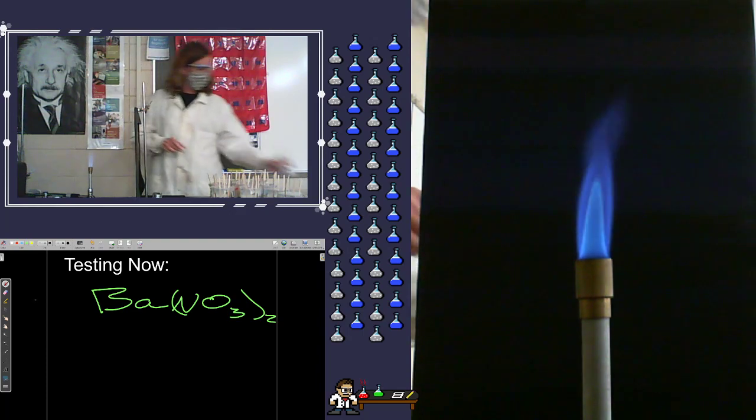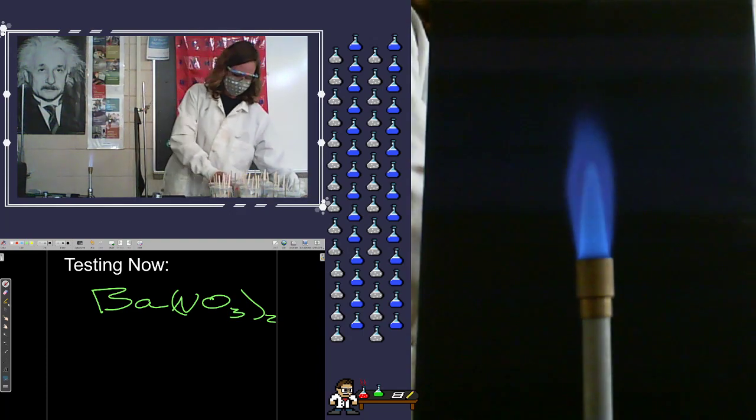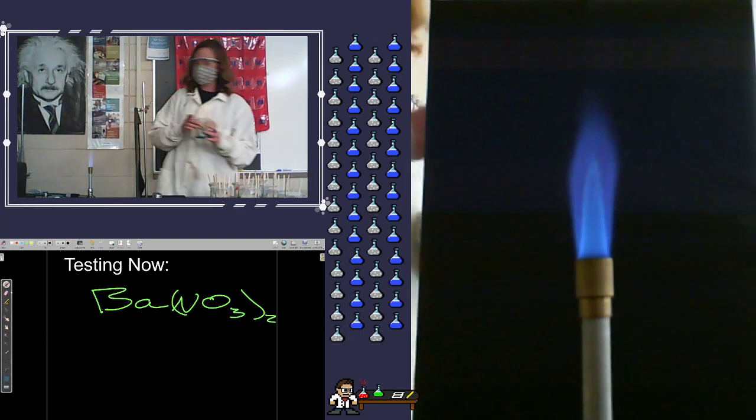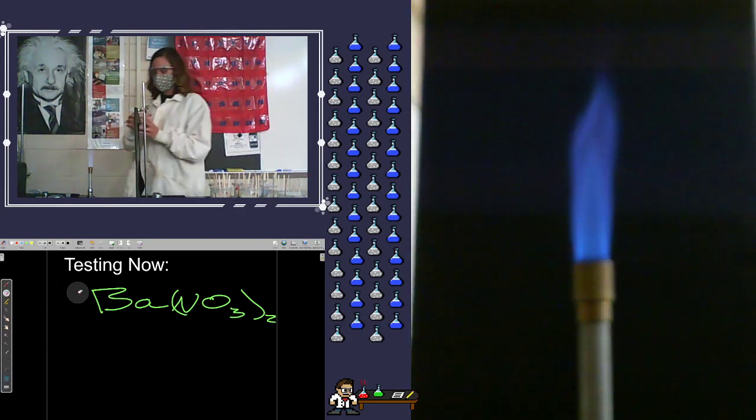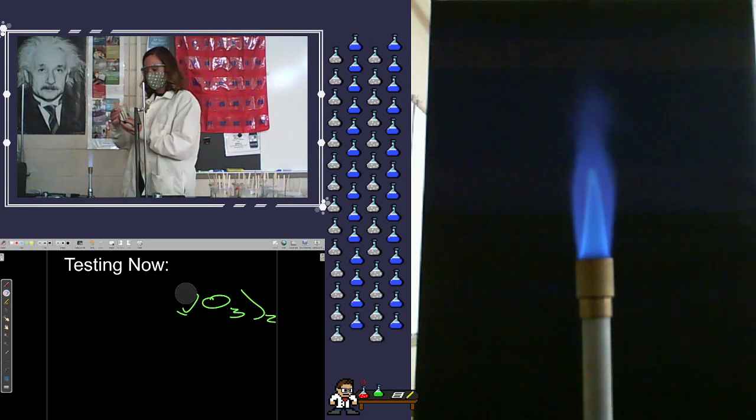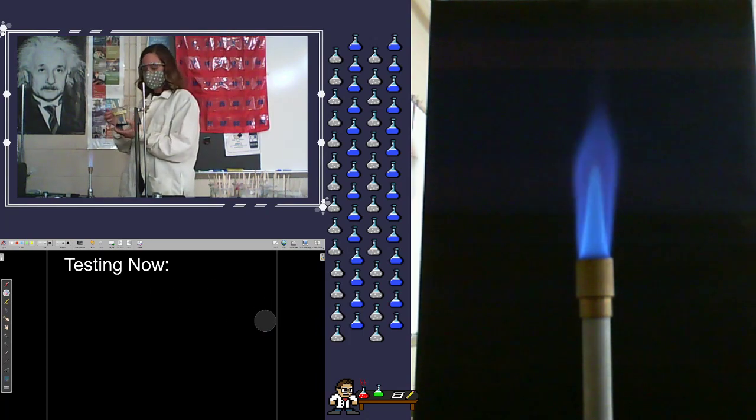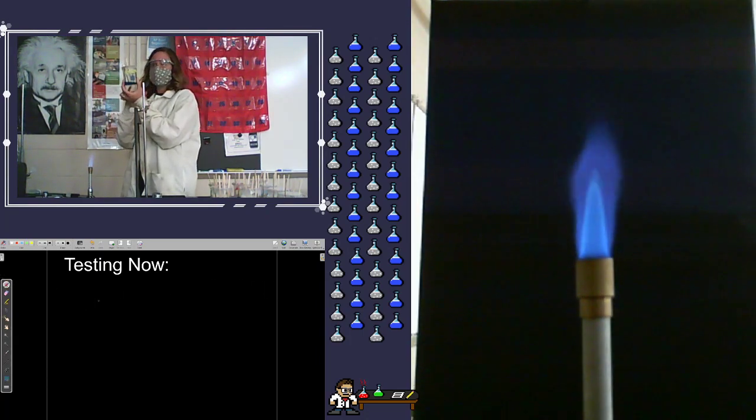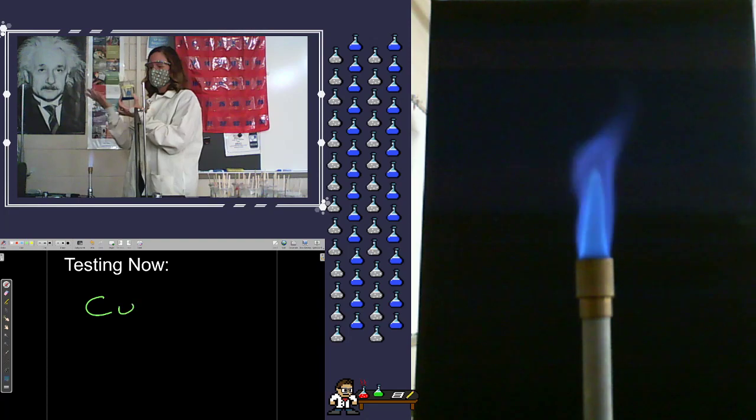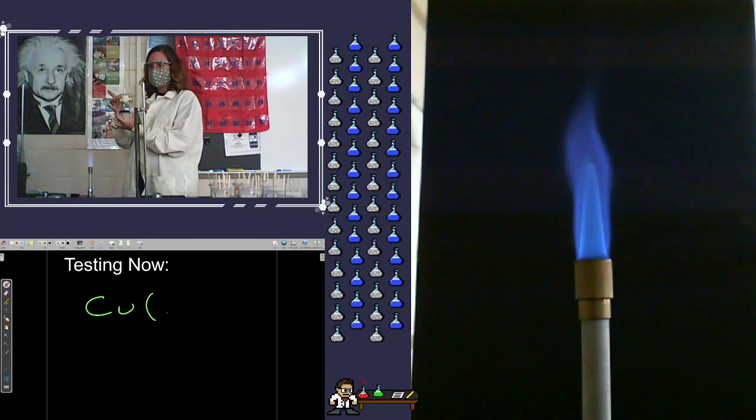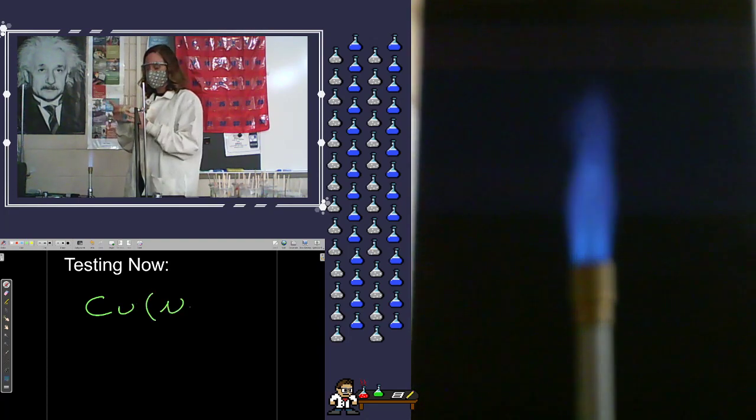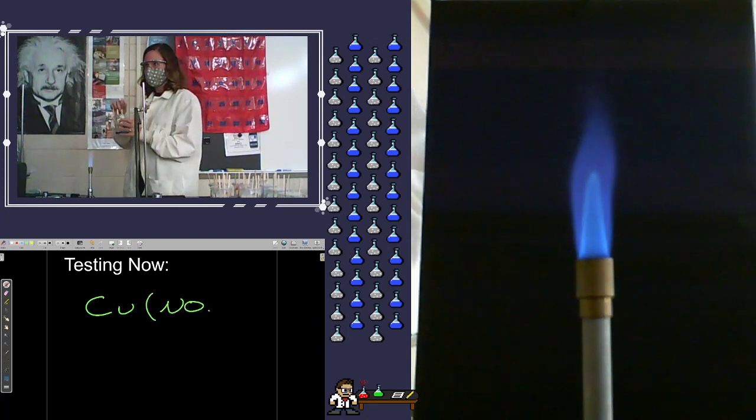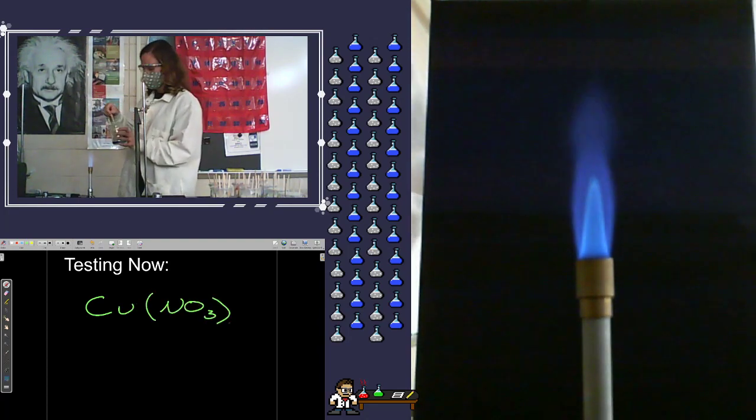Wonderful. Our next one, which is quite possibly my favorite, is copper 2 nitrate. And this copper 2 nitrate, you notice that it has a blue liquid. But is that blue liquid, is that blue color going to affect the color of the flame you see?